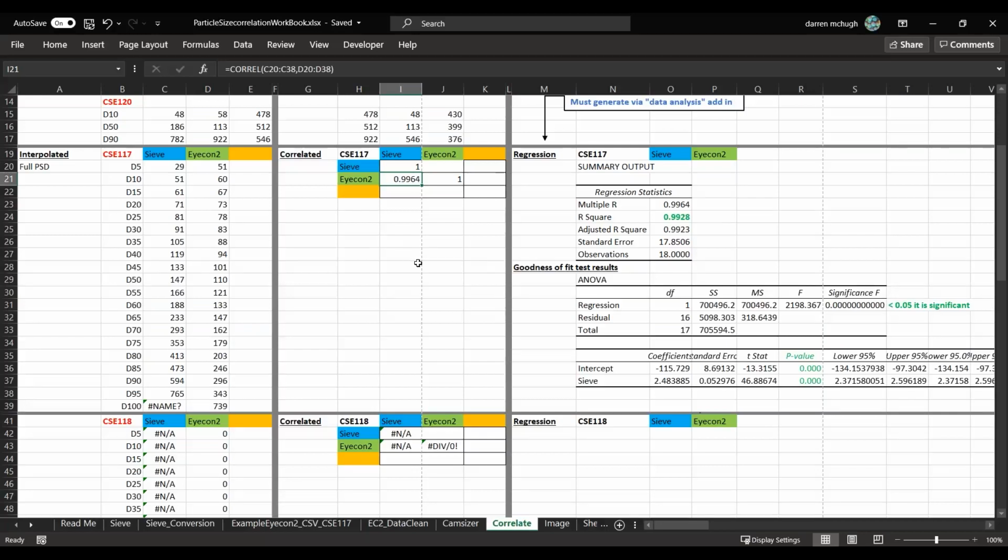What you do after you correlate is then you can look further into it by doing a regression analysis, essentially looking for a straight line between all the values and working out your R squared. And the regression analysis takes it a bit further because it can independently look at the relationship between, let's say, A, which is Sieve, and the relationship between B, which is Icon, something that correlation doesn't do. So this next step here is automatically done by Data Analysis in Excel. I'll show how you do that a little later on. Right now, it's already here for us, and I'll just talk about the values.